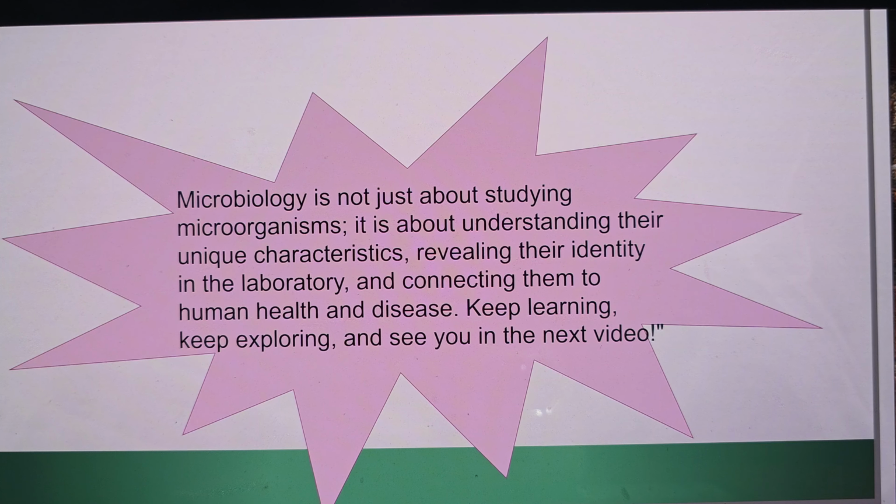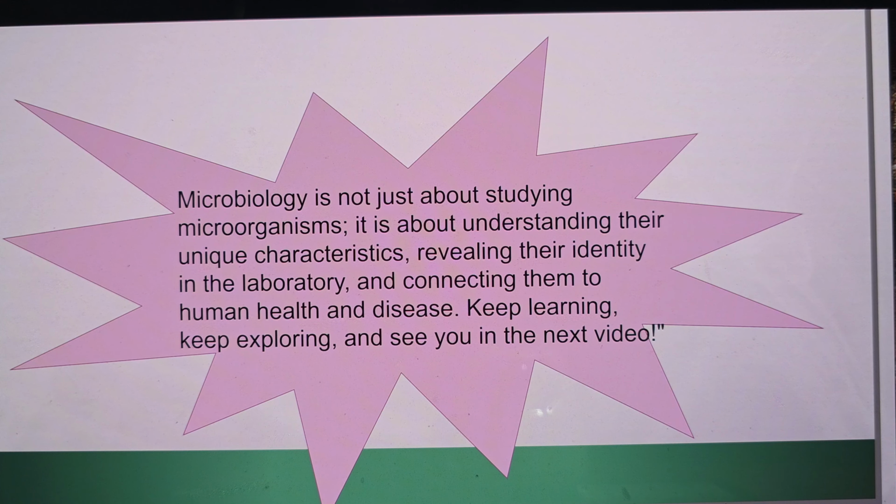Microbiology is not just about studying microorganisms, it is about understanding their unique characteristics, revealing their identity in the laboratory, and connecting them to human health and disease.